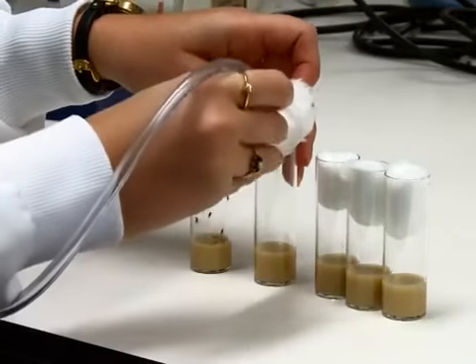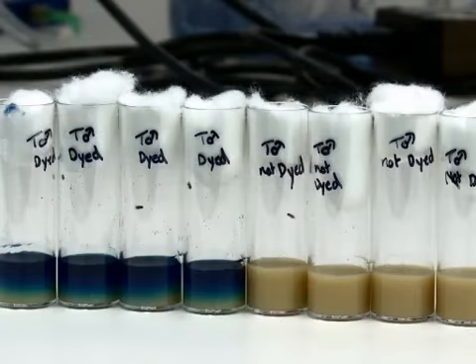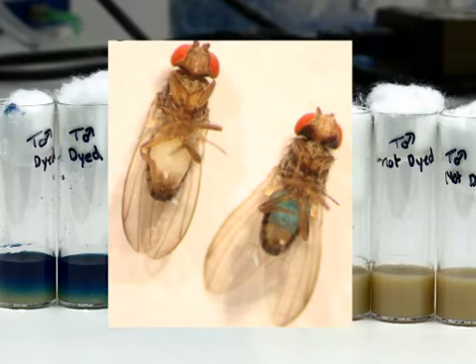Next, transfer flies onto the food according to the needs of the experiment. Within one day, the dyed flies can easily be distinguished from the non-dyed flies.